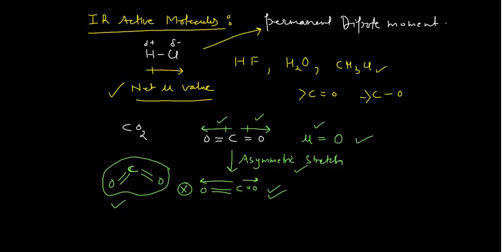First of all, in IR spectroscopy you should know this point. Your atoms are generally considered as balls, and then your bonds are regarded as springs.